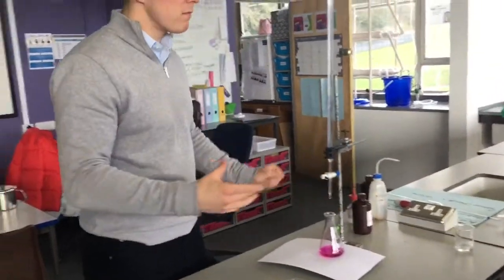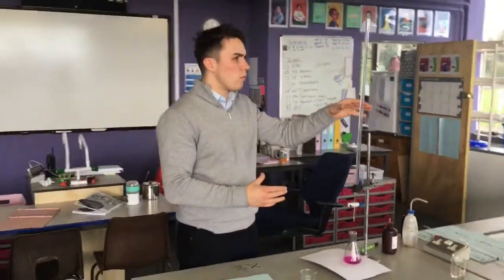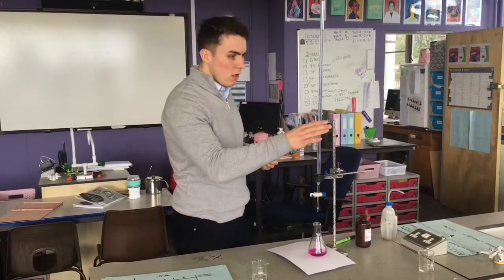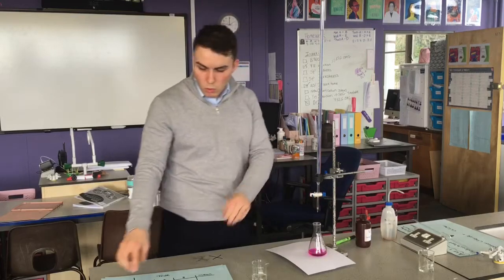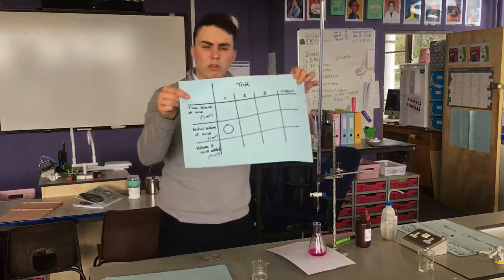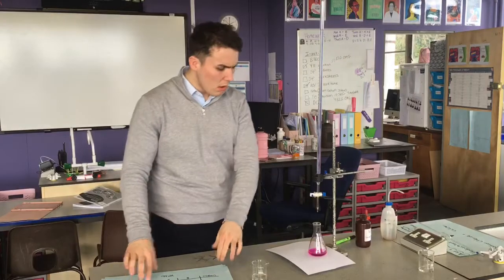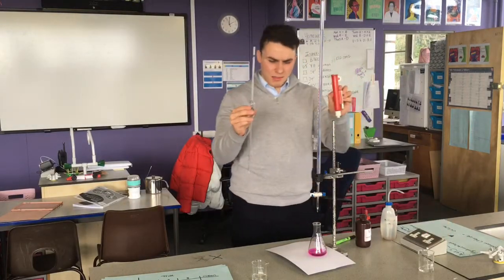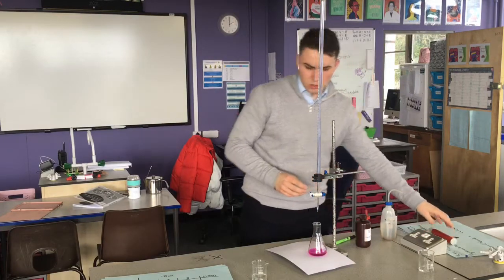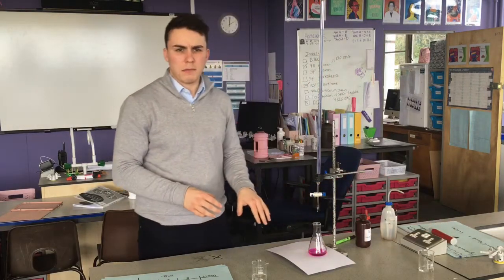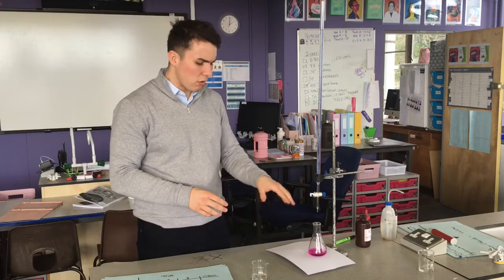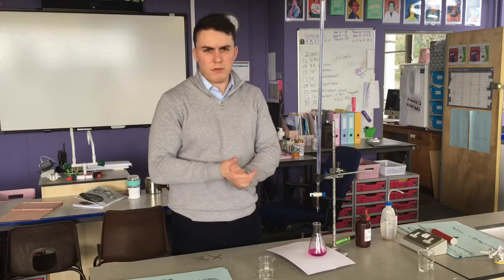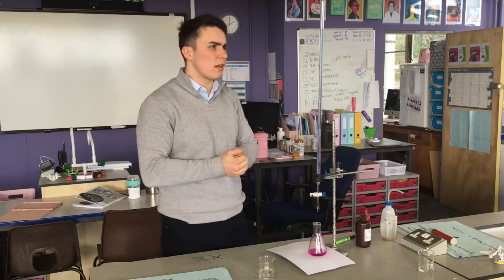Quick recap of what I've done: I've filled my burette with hydrochloric acid — remember, I know its concentration is 0.1 molar. I've then recorded my initial volume. I've used a glass pipette and a pipette filler to place 25 centimetres cubed of base in my conical flask. And then finally I've added some phenolphthalein. Now is the time when we need to do our titration.